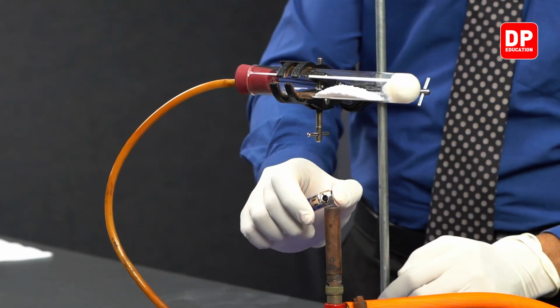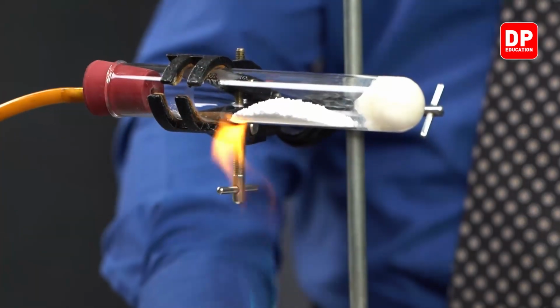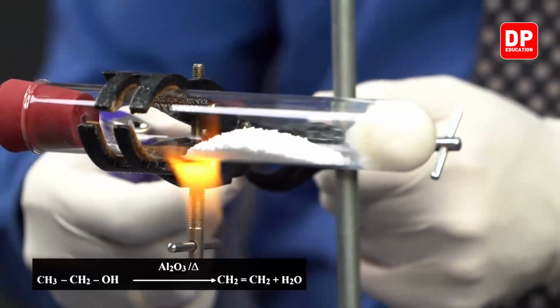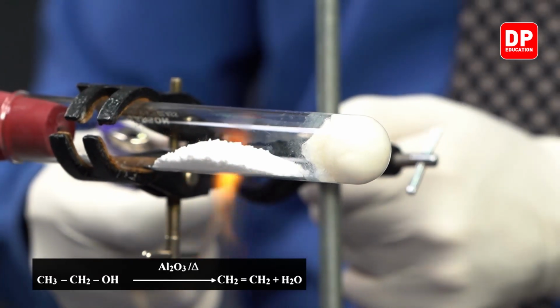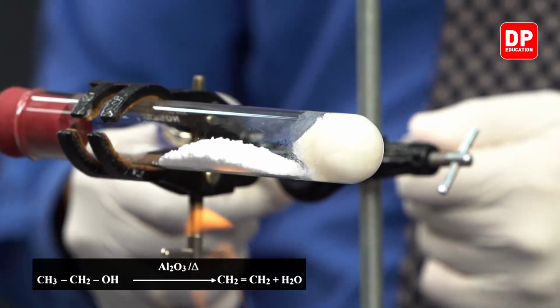So we'll light our Bunsen burner and we can start heating up the alumina that we have here.